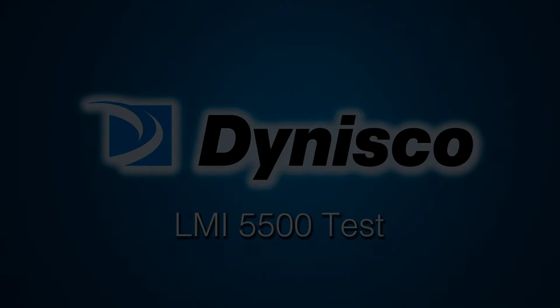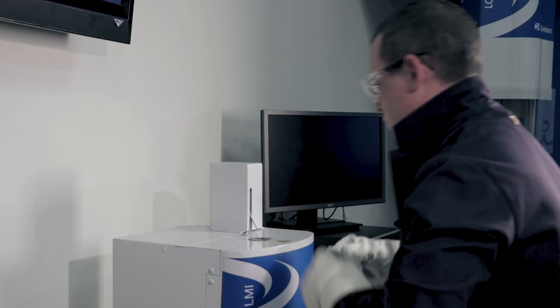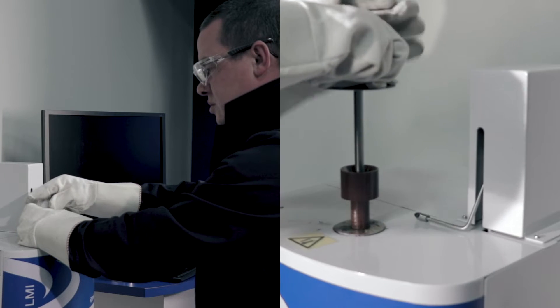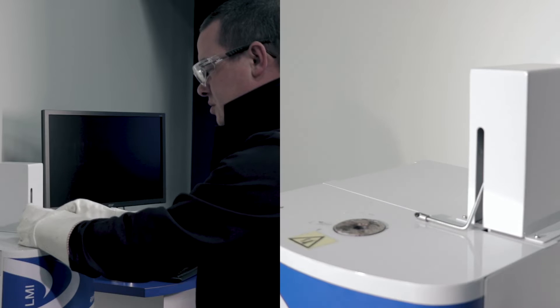Today, we will look at the LMI 5500 series melt flow index machine and the Method A test per ASTM standard D1238 or respective ISO standard.